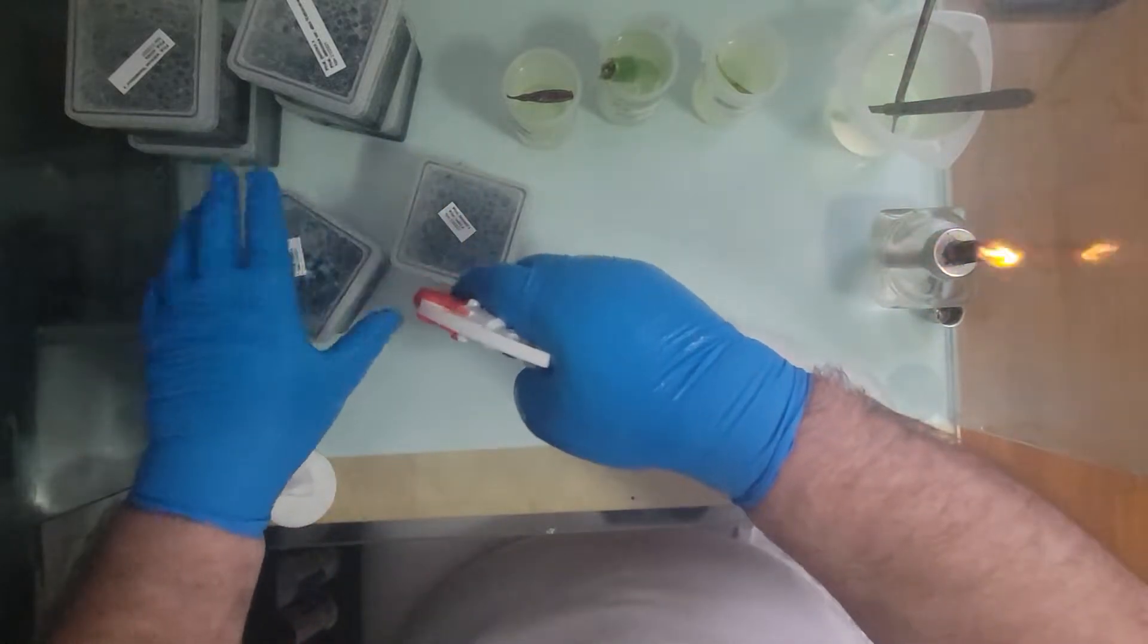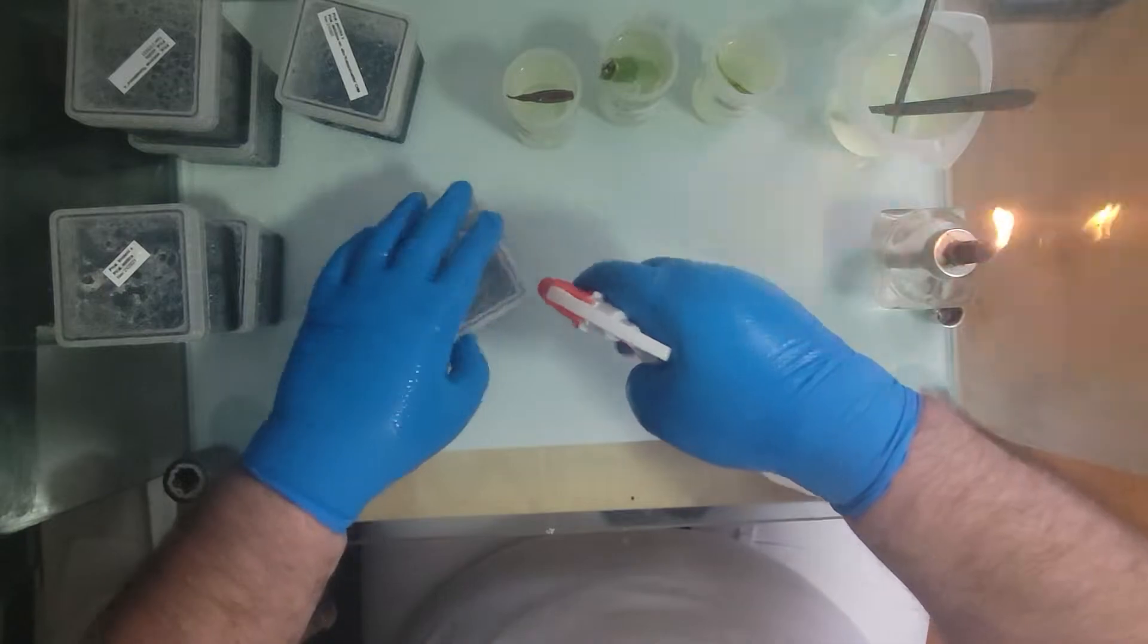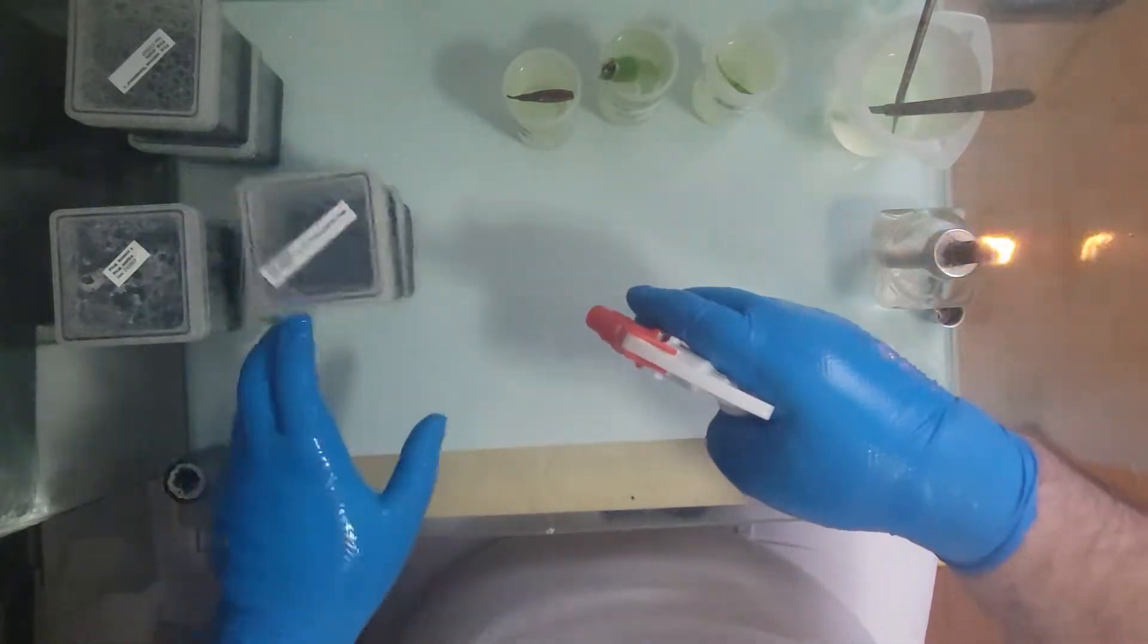First we spray the containers. I've already cleaned the laminar flow hoods. I've cleaned all this area over here. I'm just going to clean the cloth one more time.